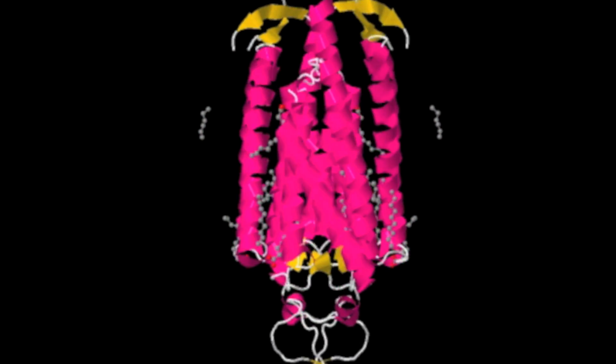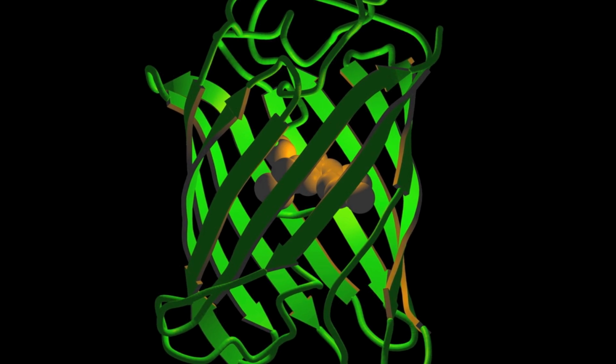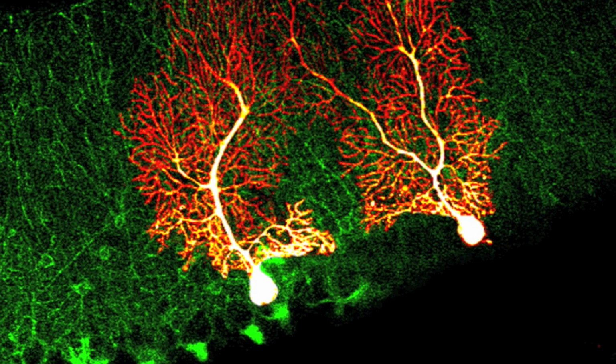So this particular brain slice was taken from a genetically engineered mouse. This mouse was expressing two proteins which are not normally expressed in a normal mouse. One of them is called channelrhodopsin and the other one is a green fluorescent protein. The green fluorescent protein makes the interneurons look green in the image, and channelrhodopsin is a light-activated ion channel. This is what we were using to study how these interneurons connect to the red Purkinje cells.